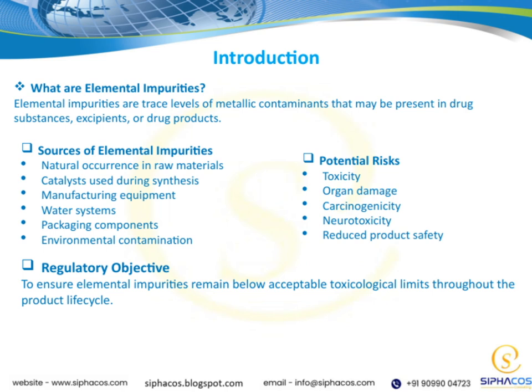They're tiny traces of metals that can sneak into drug substances, excipients, or finished products. They come from many sources: raw materials, catalysts, equipment, water, packaging, and even the environment around us. Understanding this helps us manage those risks better.